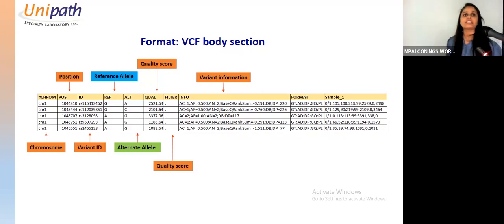So from the VCF itself, you can come to know whether your mutation is heterozygous or homozygous and what the frequency is. Frequency is nothing but the alternate allele count divided by total, multiplied by 100. So if it is germline, you get around 40 to 60% most of the time. It is homozygous germline, so that's why it's 100%. So your variant allele frequency is 100%.